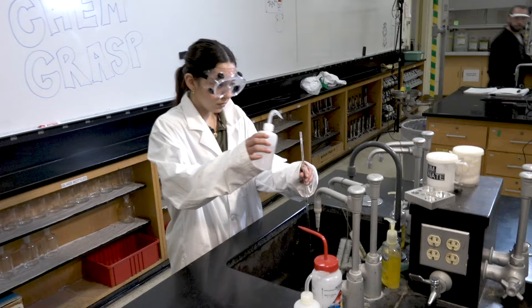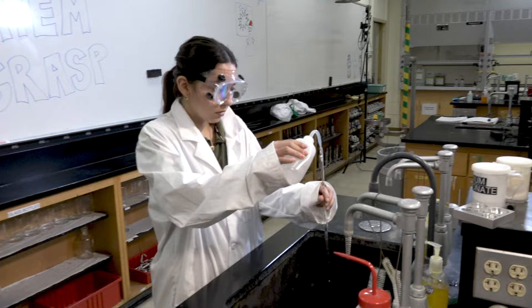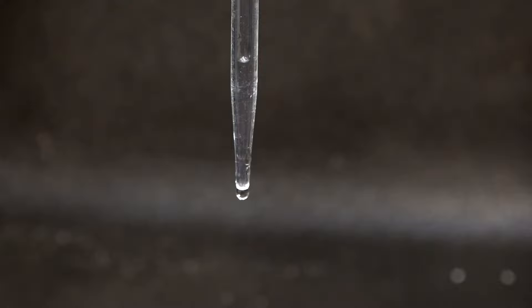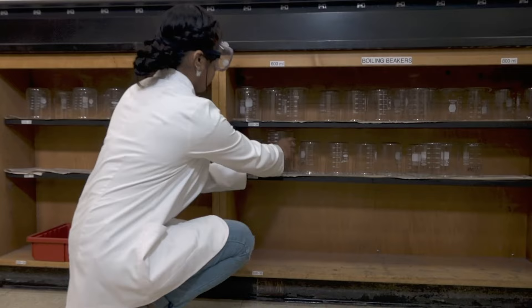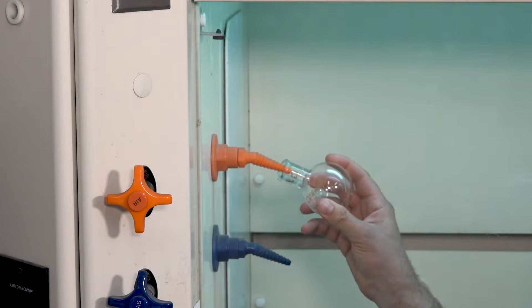Thinner pieces of glassware, like pipettes and burettes, may require a little more patience when cleaning. You can use a wash bottle to help you rinse glassware that does not fit comfortably in the sink. Remember, the goal is to thoroughly rinse all glassware surfaces with plenty of water before returning the glassware to storage. Once your glassware is cleaned, it can be returned to its proper storage location in the lab. It might take you a few experiments to learn where everything is in the lab, but you'll quickly become acquainted with your classroom. If you are unsure of where anything goes, simply ask your instructor.